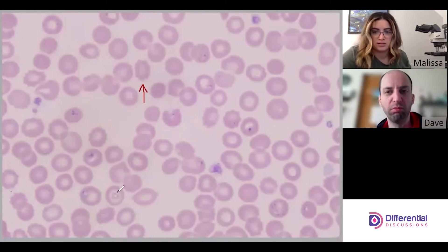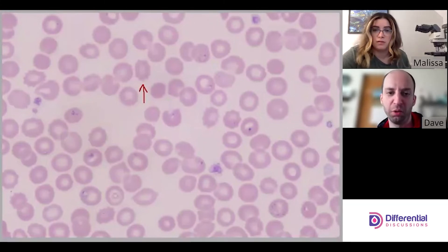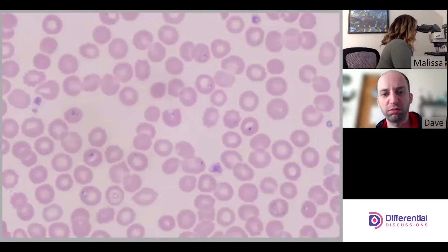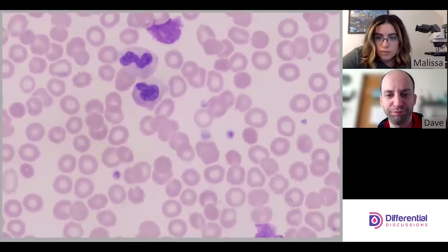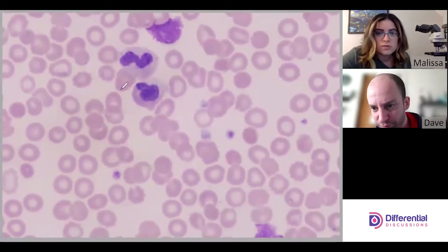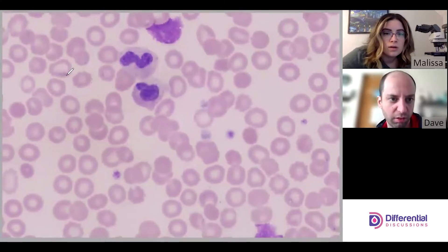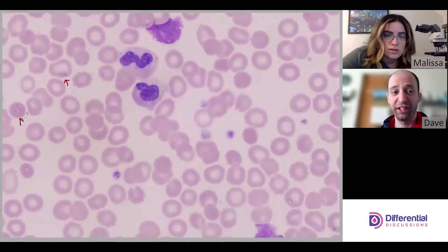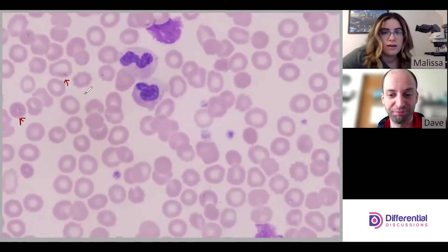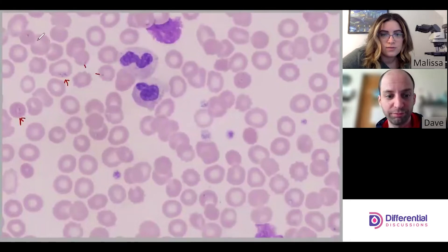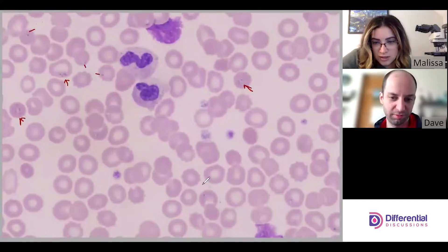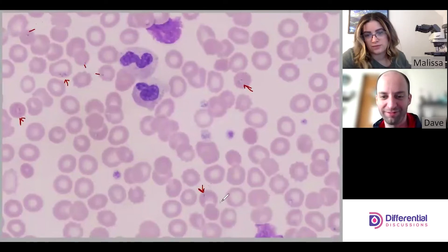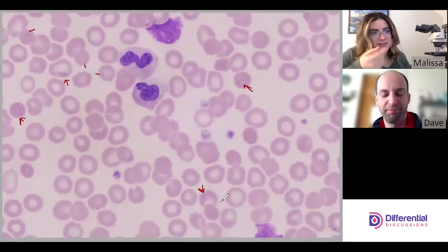Nothing else noteworthy — let's move around and see what else we can find. There are some white cells, some neutrophils. It looks like there are some organisms in here. Here, here, here — this is a really nice ring right there. You can see the dot and then the ring. And there's another nice ring here; I'm trying to use the fine focus so you can see these little rings.